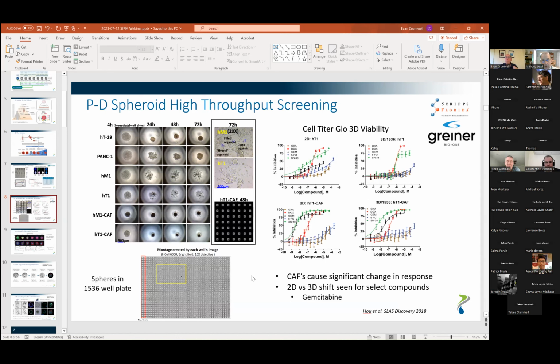Okay. Right. So they're taking the patient biopsies. They're finding the cancer cells that are going to propagate, might be 20% of the cells, and then allowing those to propagate up to the point where they have enough cells to start creating these spheres. So can you also comment on what your take rate is? How often do you get a solid tumor sample that just doesn't progress to forming a 3D culture or organoid or spheroid?